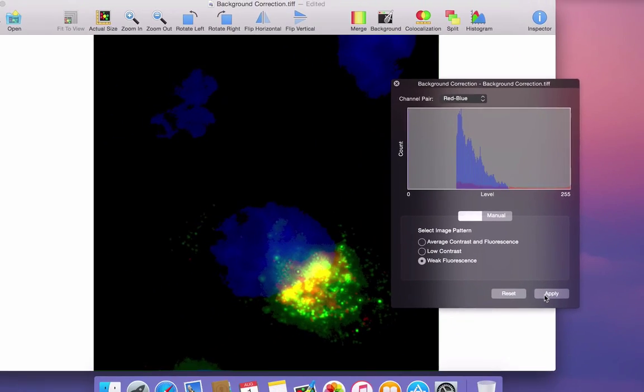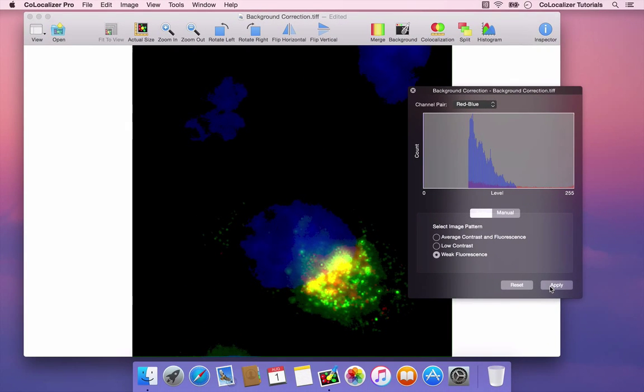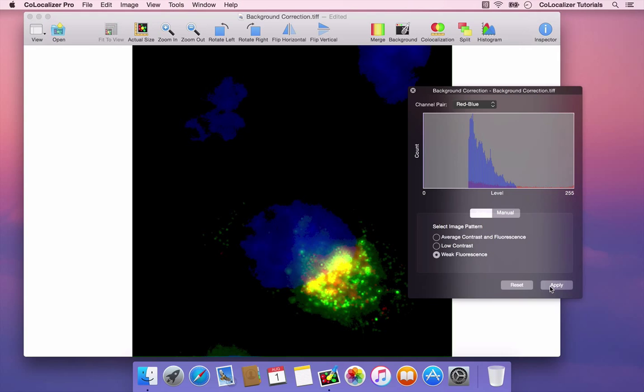Background correction is a crucial step in quantifying Colocalization. The ability to see histograms of images before and after correction is of great help for performing it properly.